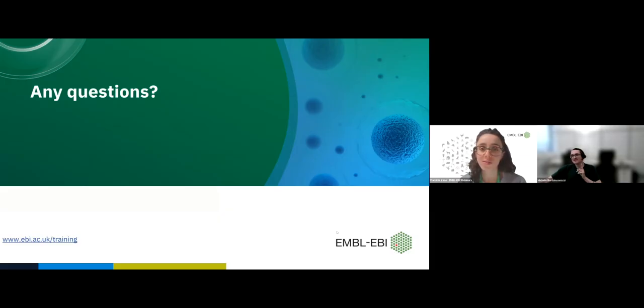Sorry, the R package from Bioconductor is zellkonverter, like cell converter, but with a Z instead of a C. So zellkonverter, written with a Z, for the converter part between AnnData and SpatialExperiment. Okay. Thank you.